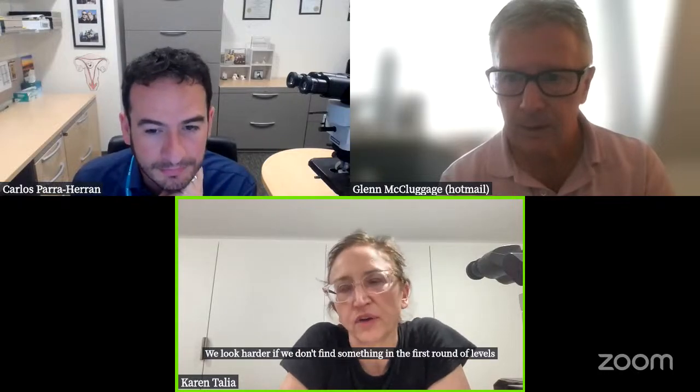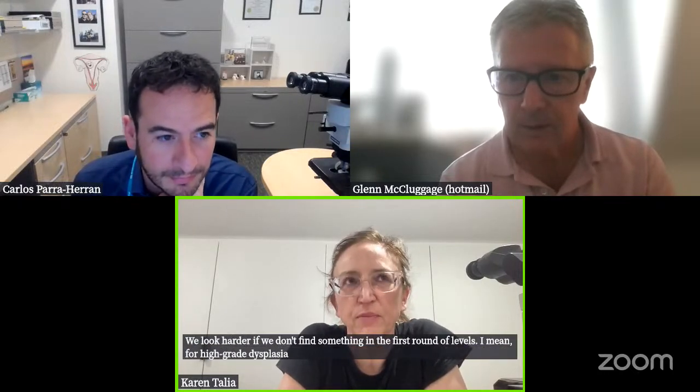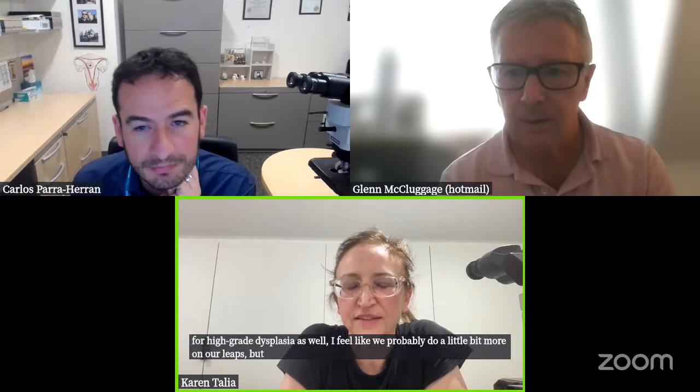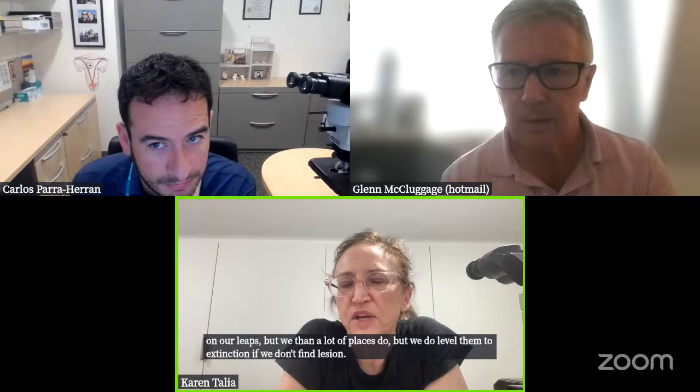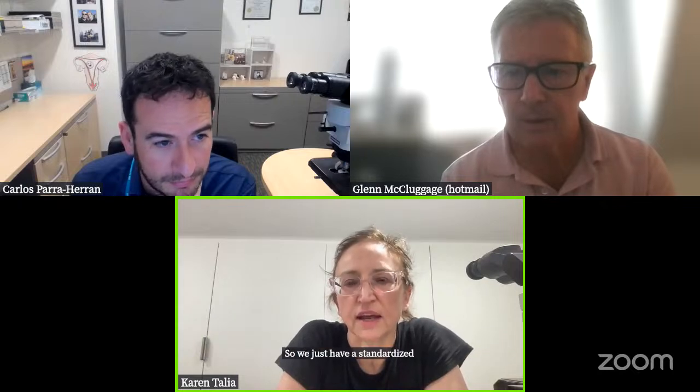For high-grade dysplasia as well, I feel like we probably do a little bit more on our LEEPs than a lot of places do, but we do level them to extinction if we don't find a lesion. So we just have a standardized approach to cutting and tailor the number of levels that we look at until we are satisfied that we've exhausted the tissue to find the lesion.